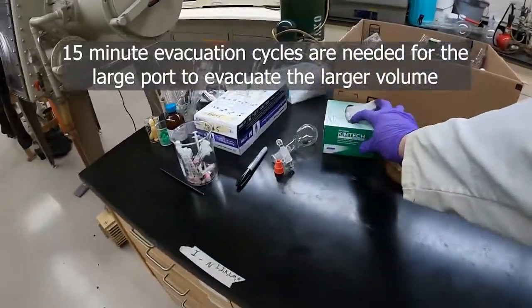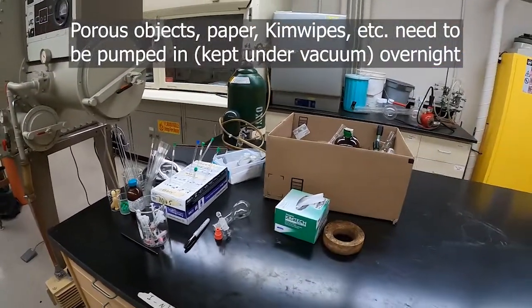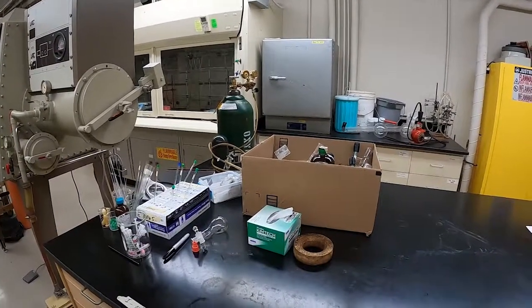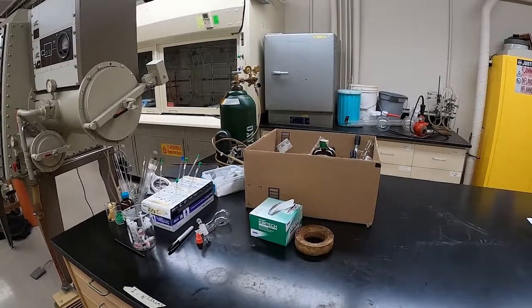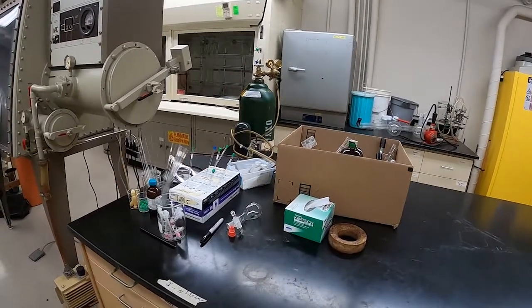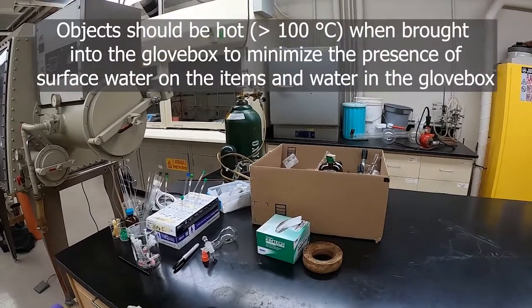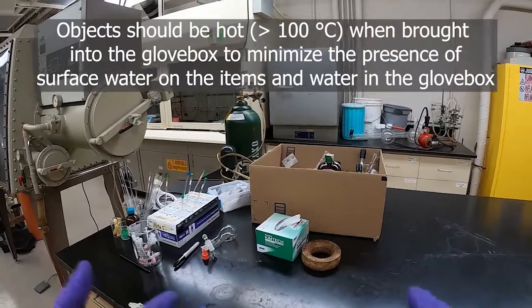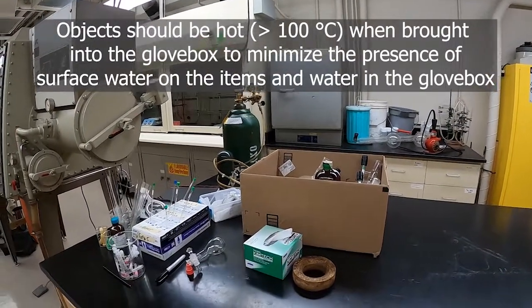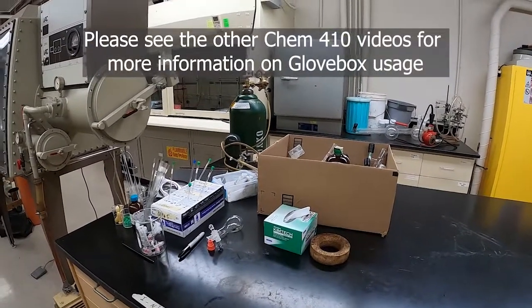If you're bringing in really porous objects like a box of Kimwipes or a cork ring, those kinds of things need to be pumped on for an extended period of time — at least 12 hours — so that you can get any water and air out of them. Because they're porous they can contain a lot of oxygen and water that we don't want in the glove box atmosphere. Recall that any empty glass objects should be brought in straight from the oven so that any water absorbed on the surface is driven off before entering the glove box.